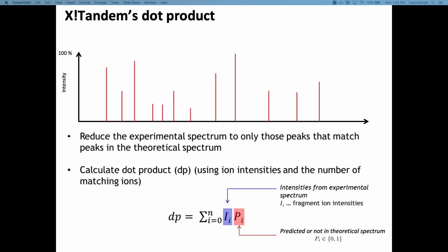Now, one of the things that can happen that is often overlooked is this type of approach also gives you scores if the peptide that you're looking at is not in a database at all. How can that happen? Missed cleavages, yeah, that's one source.